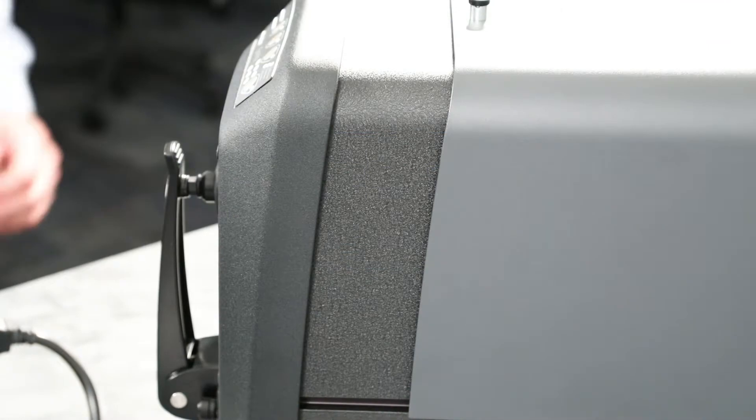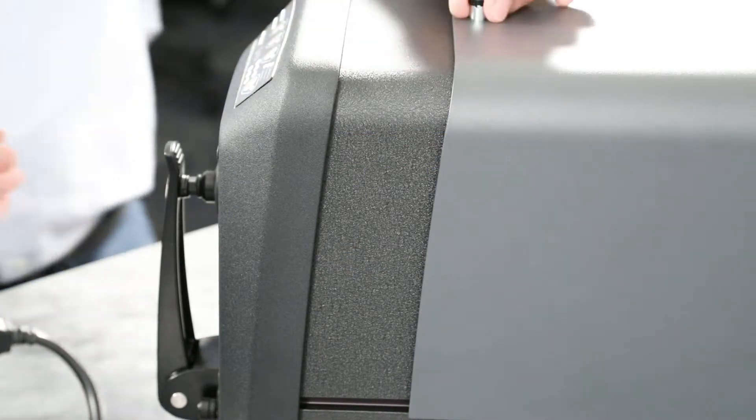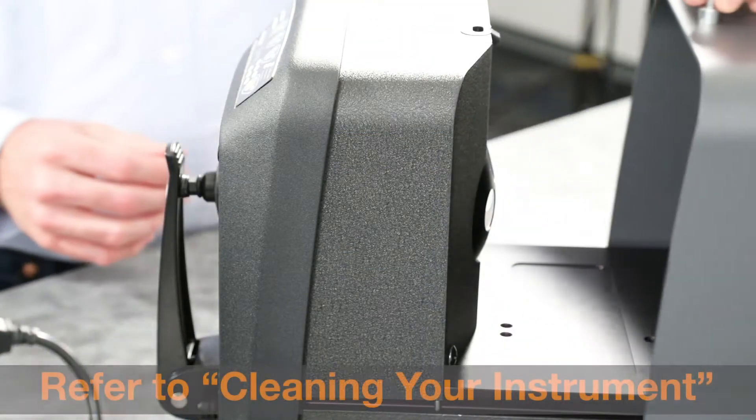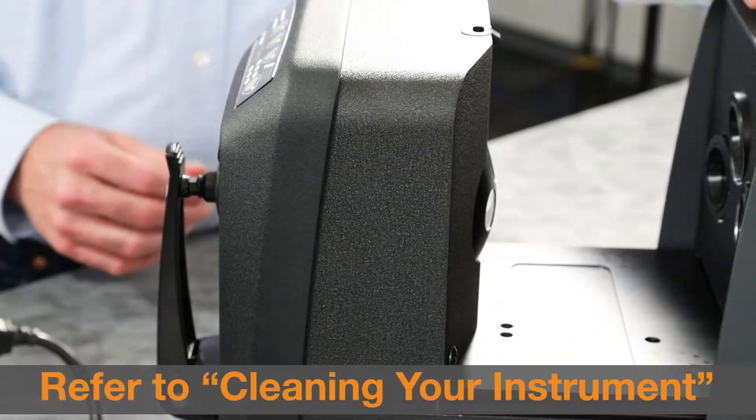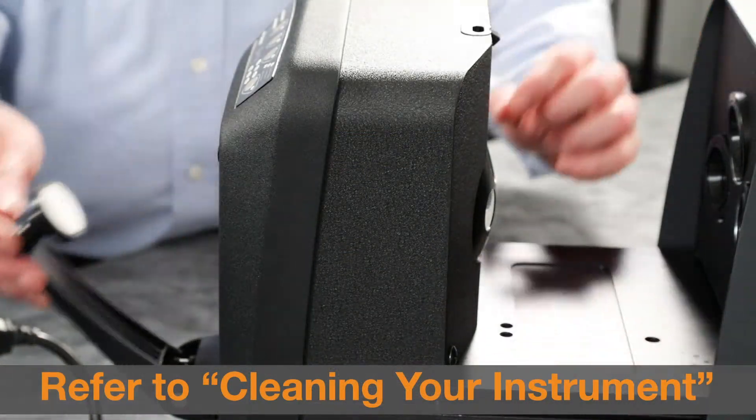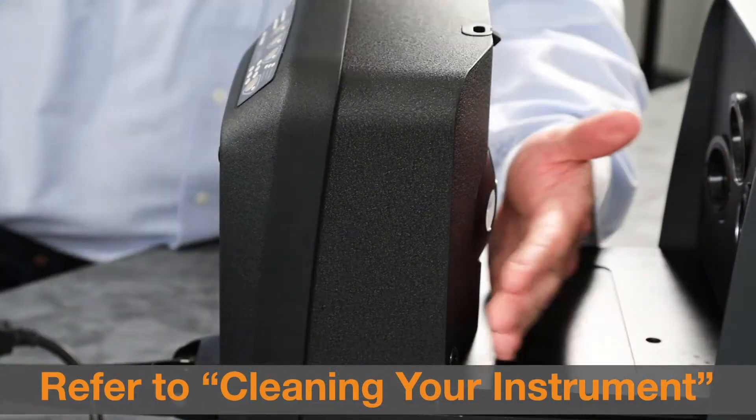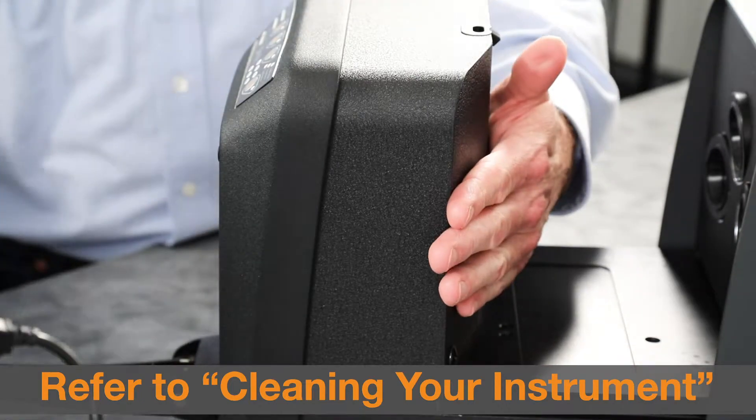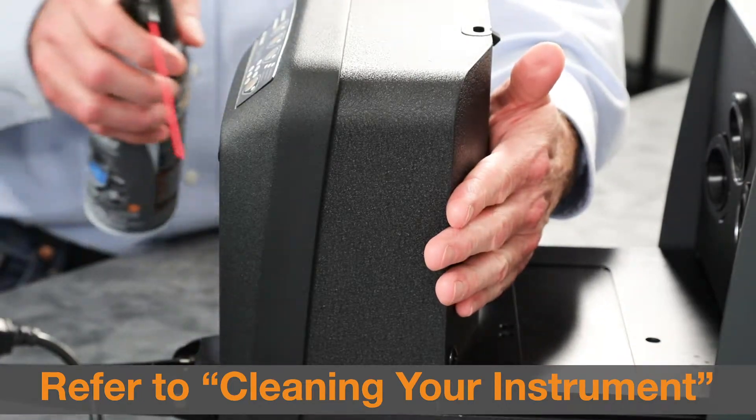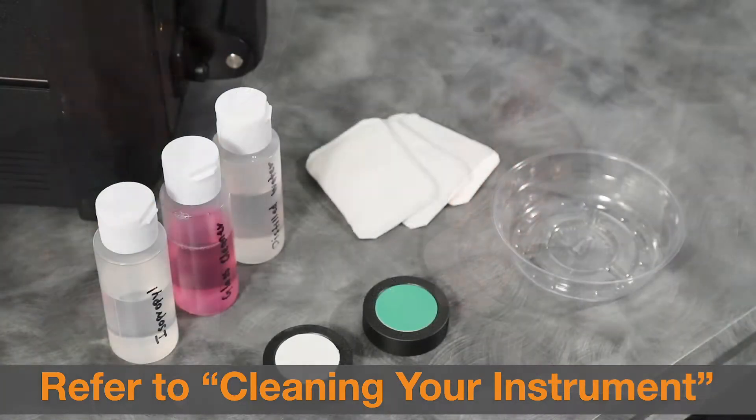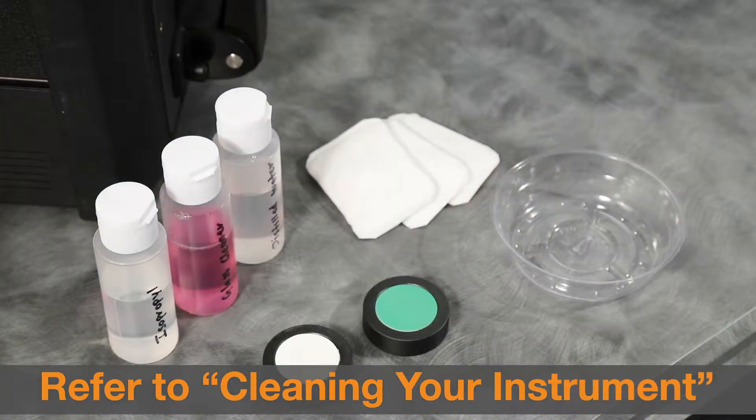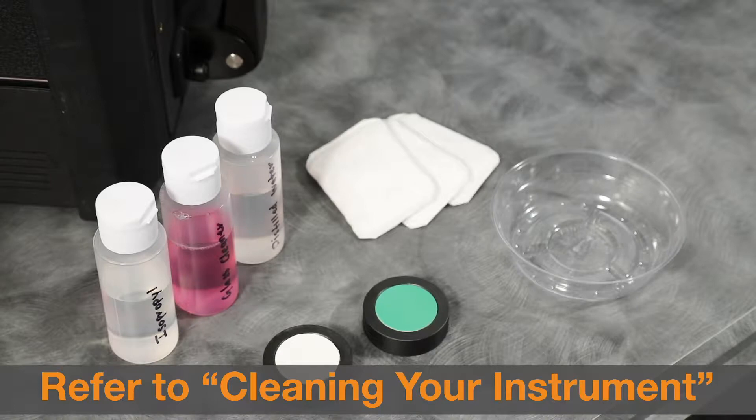Before calibrating your instrument, make sure your optics area, white calibration tile, and black trap are all free of dust or dirt, as that can dramatically affect your calibration. Refer to the video on cleaning your instrument to learn more.